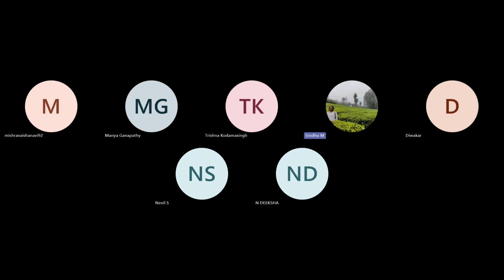And once you have this raw data, if you want to do any specific analysis, then you can export it as .tif for all the analysis that you want to do, for example, to quantify fluorescence levels and so on.